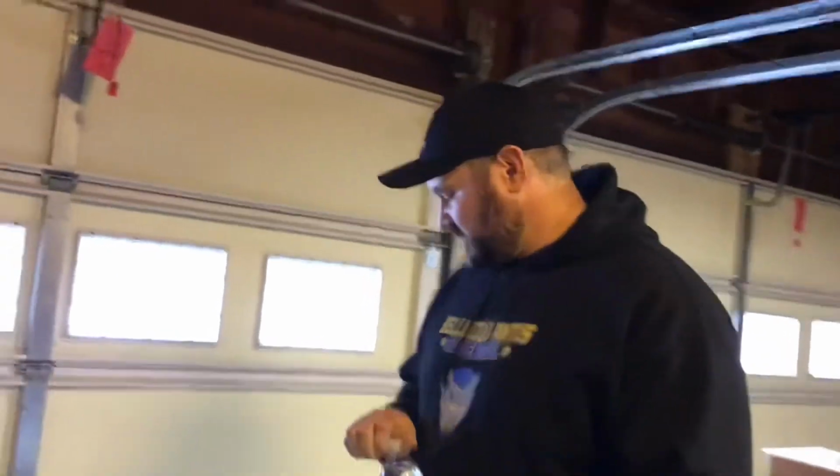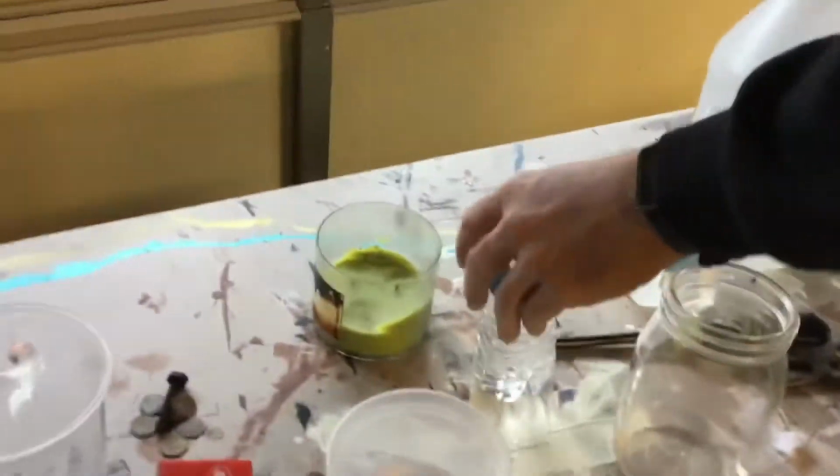So now we talk about formation of a gas or bubbles being formed. So here's a real good one for formation of a gas. So I'm going to take just some plain old water from one of these little bottles, and I'm going to react it to, we're going to use these Alka-Seltzer tabs, which are used pretty common in a lot of 8th grade experiments.